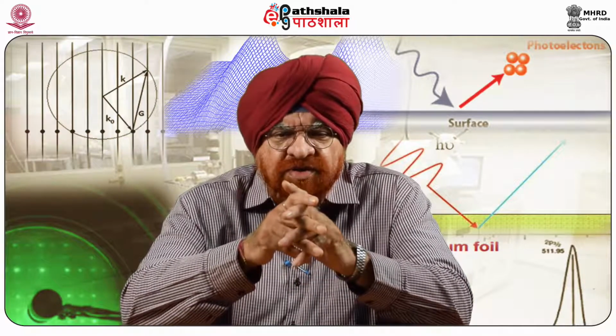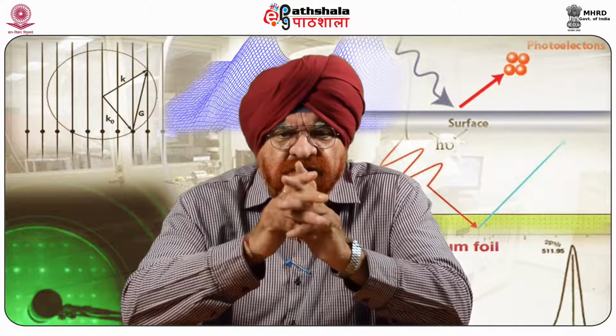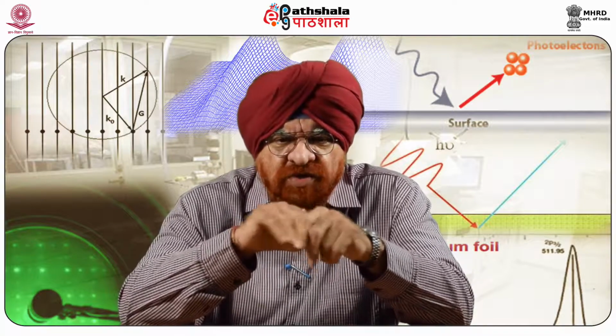While the cantilever maintains a constant separation while scanning, the significantly lower forces in non-contact mode than in contact mode allow even the softest sample to be imaged without damaging it.